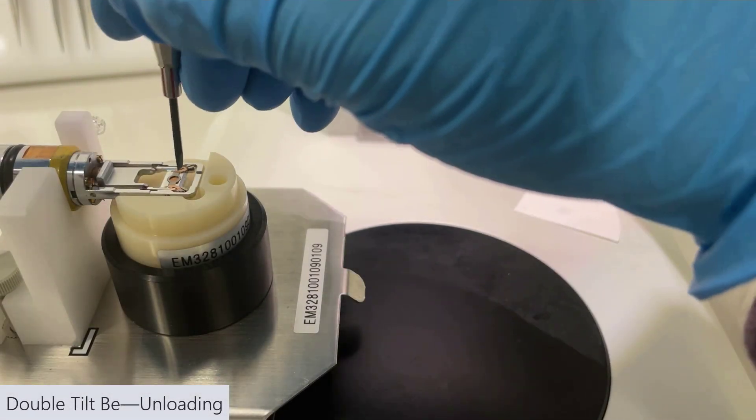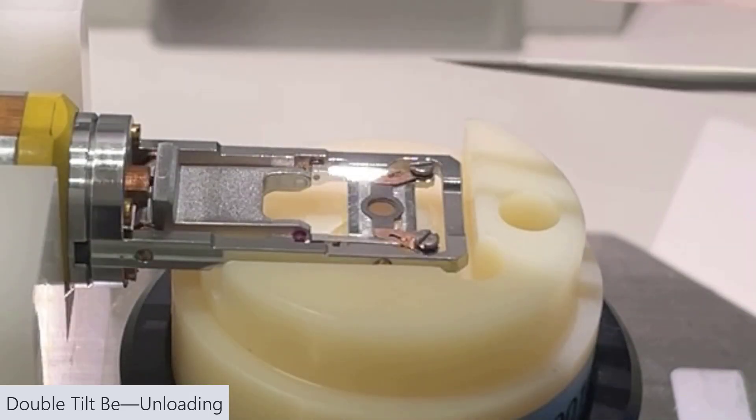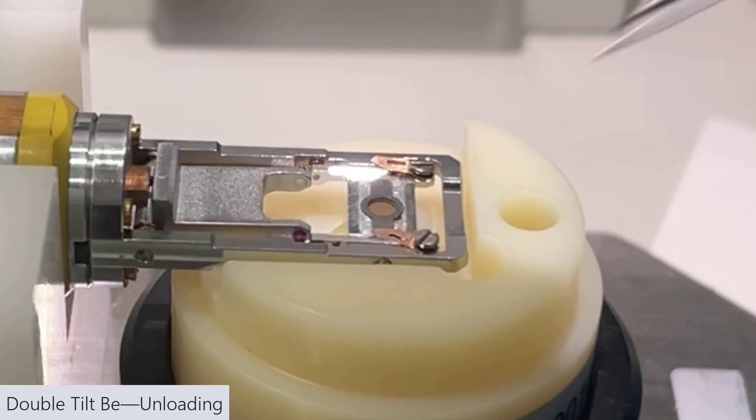Now, for unloading, same deal in reverse. Loosen our screws a couple of turns. Move the metal pieces out of the way.